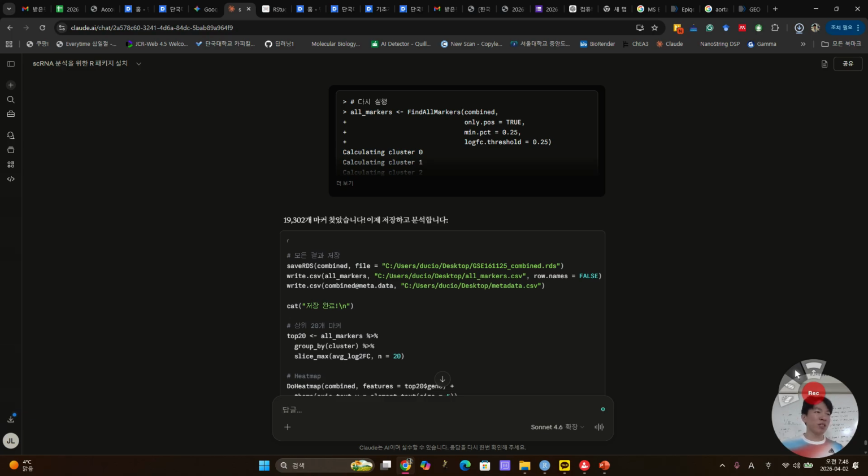And then you can ask here, what is the nerve tissue single cell RNA sequencing data? And then there's something based on that paper, or just think of this GSA data set. Maybe you can use this data set.